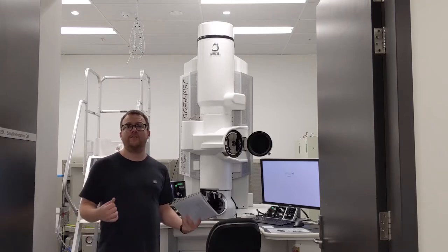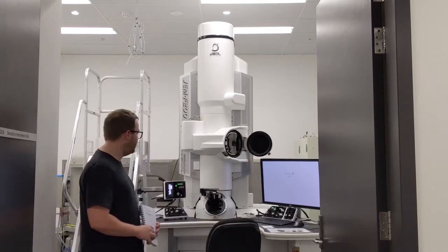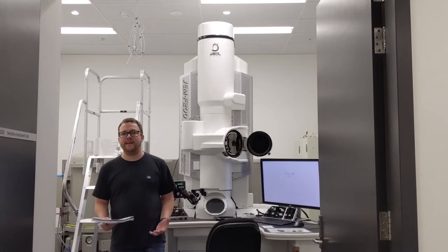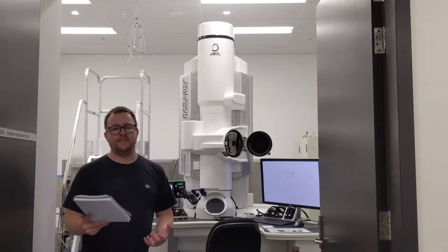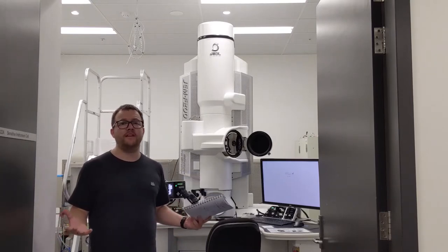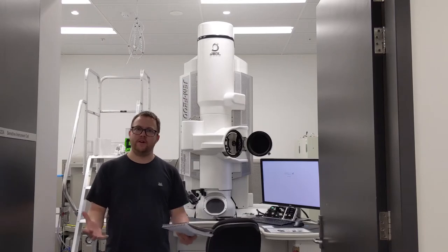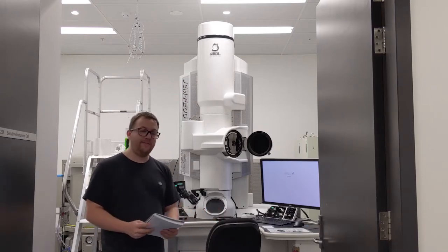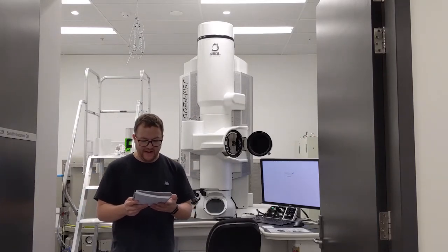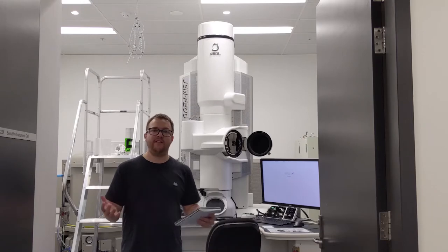Finally, we need some way of detecting the electrons. We have two main detectors in this microscope. Firstly, we have a fluorescent screen, which is here. This is mainly used for the initial alignment of the microscope and looking at the image with our eyes. When the electrons hit it, we see bright areas, and where they don't, we see dark areas, so we can see our image. And then finally, we have a digital camera, which is below the screen, around here. We can view that on the PC screen, and we can record these images for further analysis.